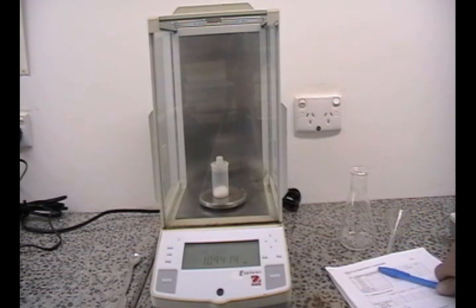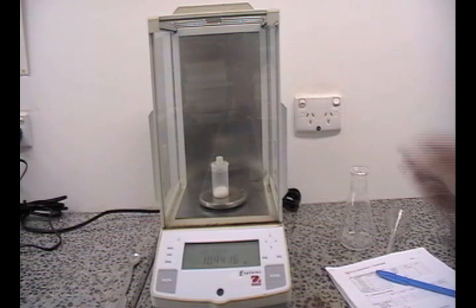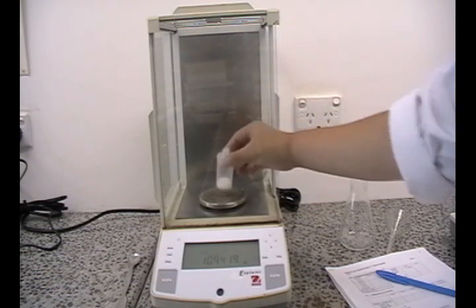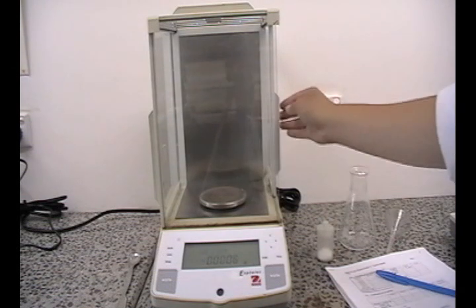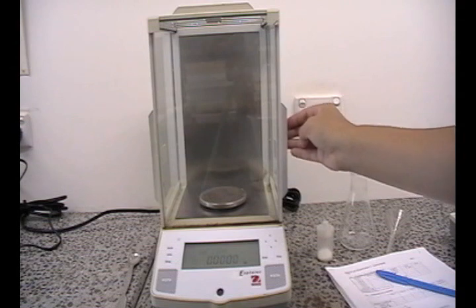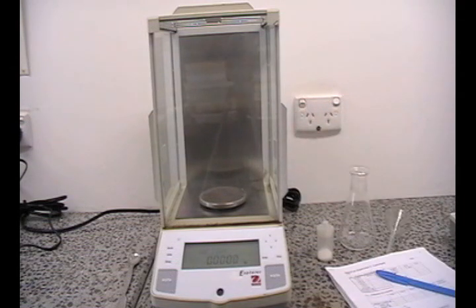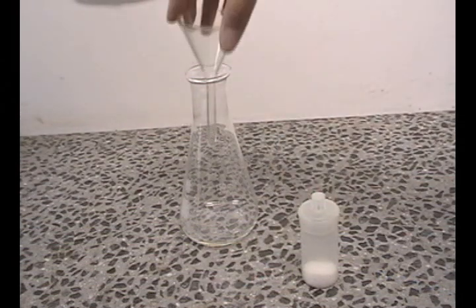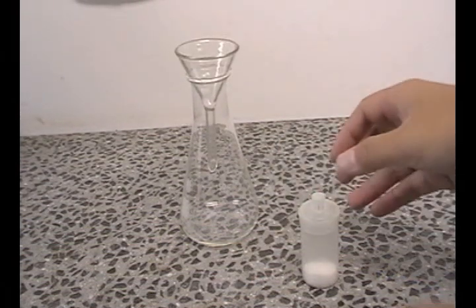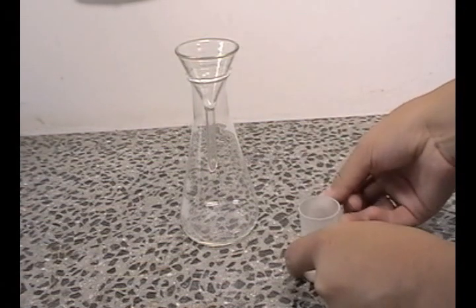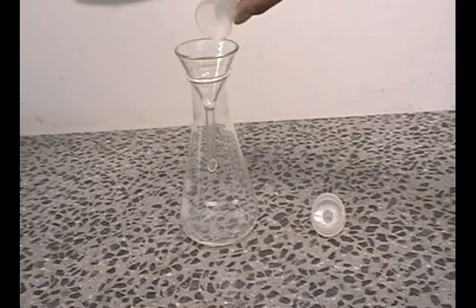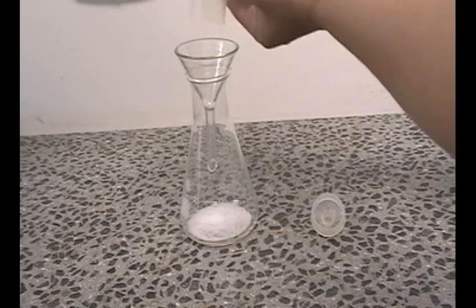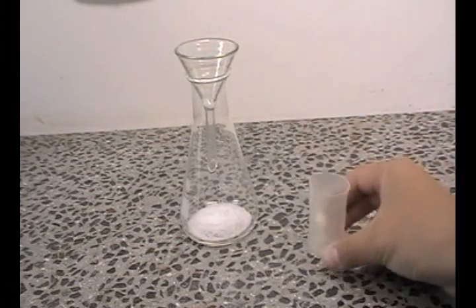When you are done, take the substance out of the balance. Remember to close your side door. Now let's transfer the substance into a conical flask. Transfer the substance into a conical flask via a funnel. Tap the weigh bottle to ensure that you are transferring the maximum amount of substance.